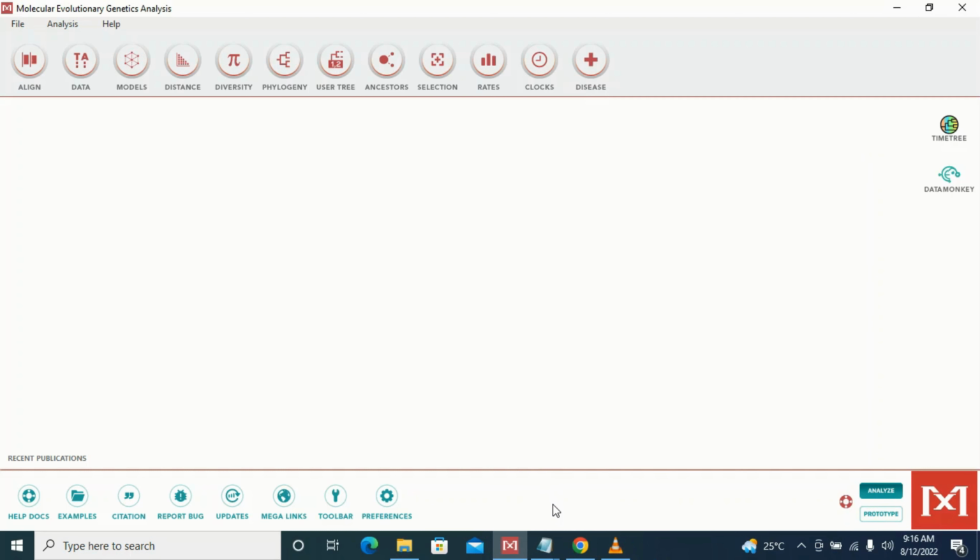Welcome back to the tutorial. In this particular video, I'm going to be showing us how you build the phylogeny tree from the files we've prepared, saved as a MEGA file. This is still my MEGA 11 tool or software.